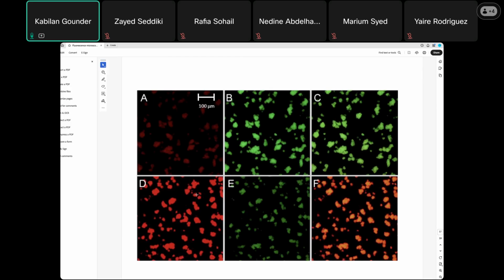we incubate diallyl sulfide, an antimicrobial agent compound, for 2 hours, and then we wash thoroughly and let the bacteria grow for 2 days. Then it forms a biofilm, and then we wash it and add the live/dead cell imaging kit that contains propidium iodide and SYTO.